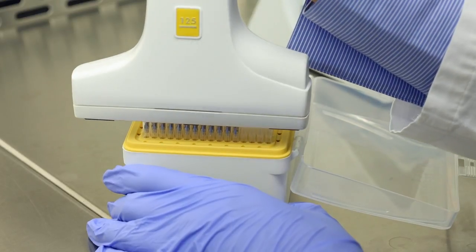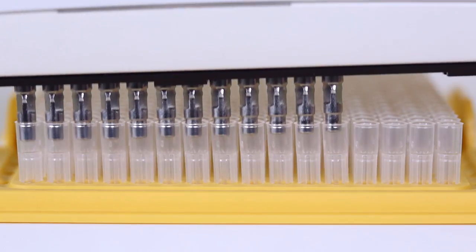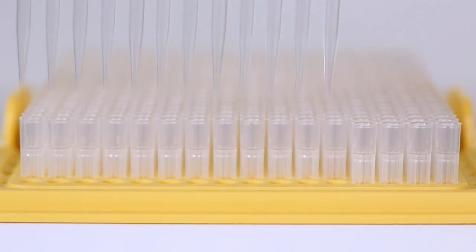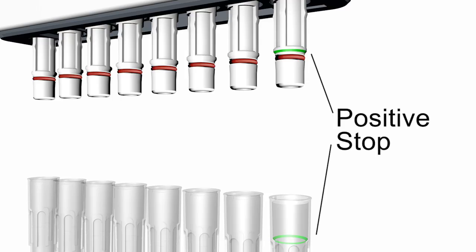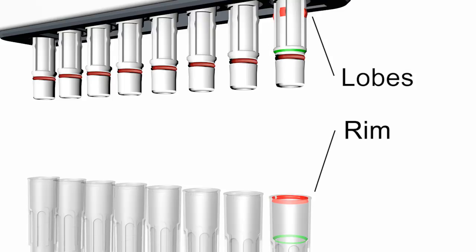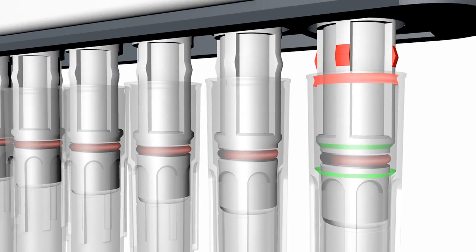Guaranteeing perfect tip attachment and sealing, Integra's Voyager Pipettes feature the unique grip tip system, enabling effortless tip loading and ejection. A positive stop ensures that every tip attaches the same way each and every time. The rim of the grip tip snaps over the lobes of the tip fitting, securing the pipette tip. Tips will never leak or fall off.